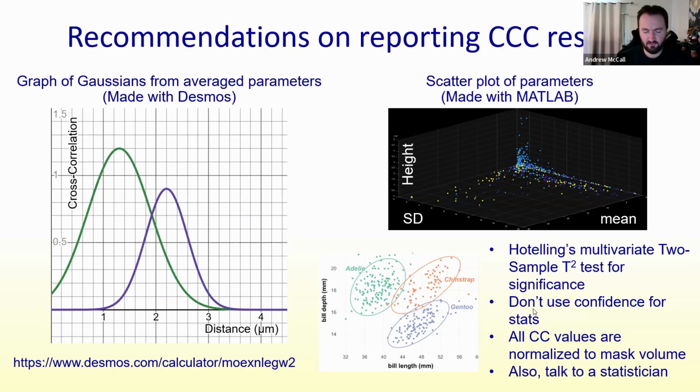Don't use the confidence for stats. It's not what it's there for. Like I said, it's there for filtering results. This has already been done by someone. It's too late. It's already been published, so I can't really do anything about it. But please don't do that.